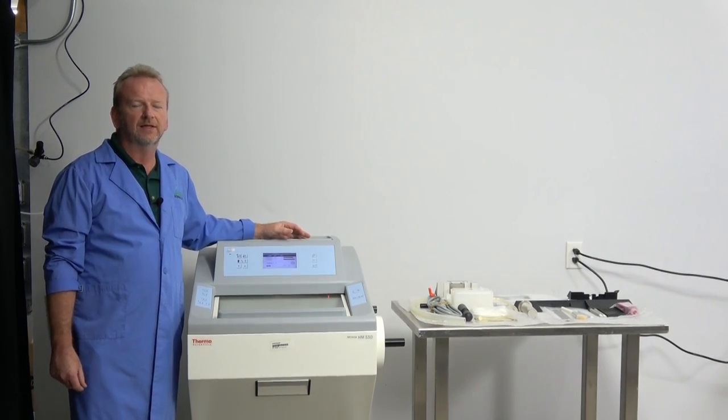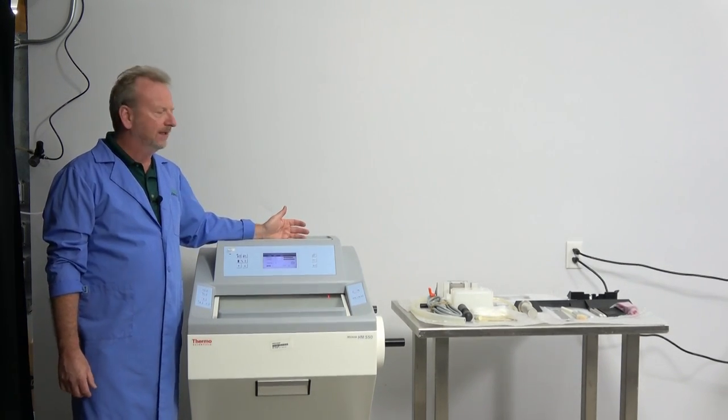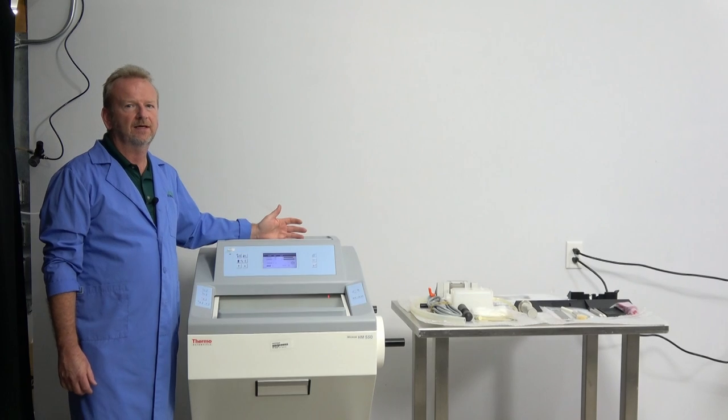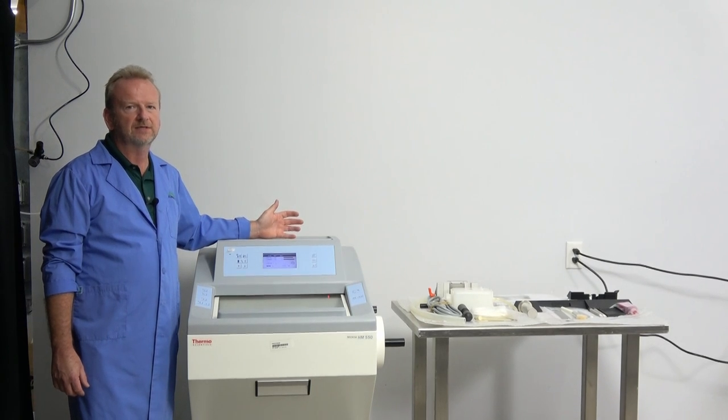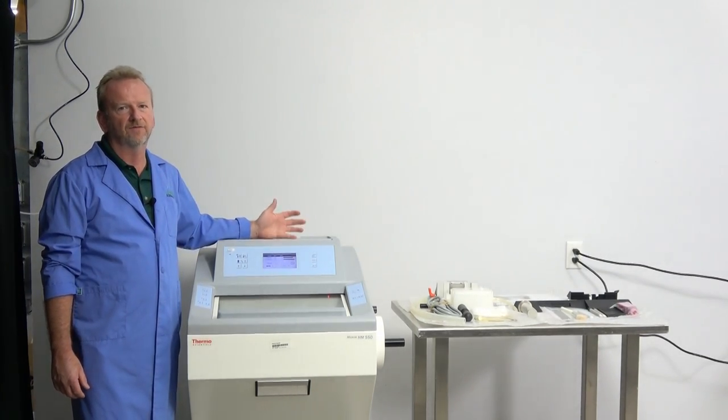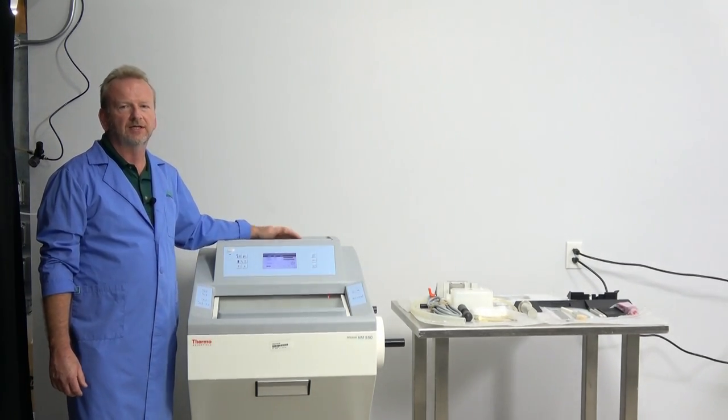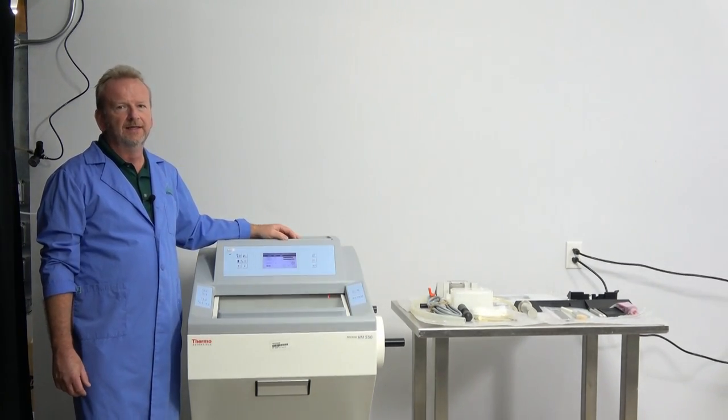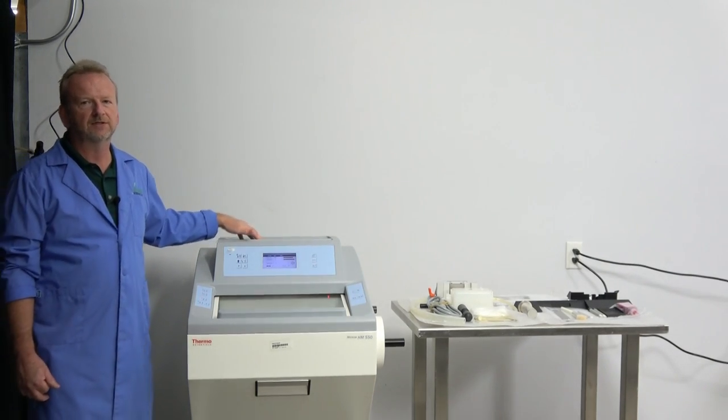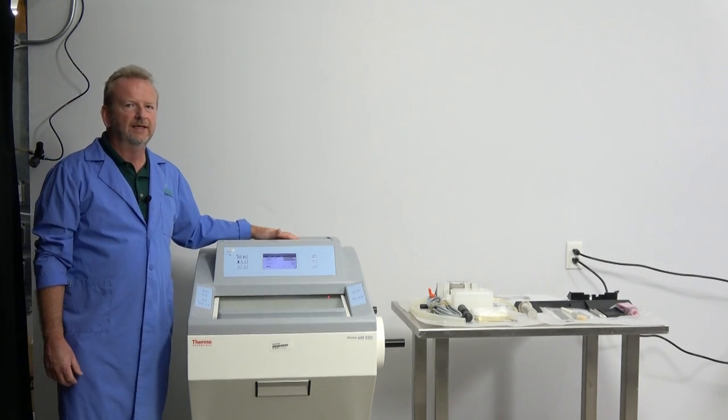And it's going to make a nice piece for somebody that's looking for a great deal for an essentially new machine. And like I said, that's what the video is about, just to reassure you that this is definitely never been used.